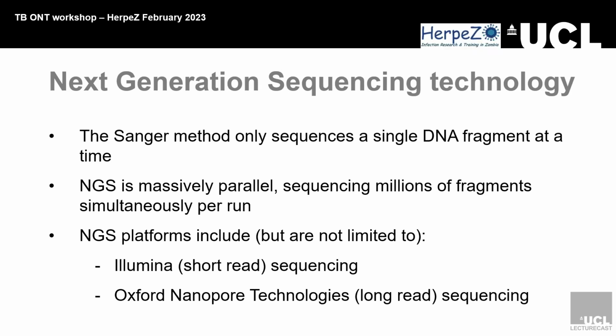So there are two main platforms that are used for NGS sequencing. Illumina, which uses shorter reads, like you were saying, from 35 to 600 base pairs, Keith? 300 on each side, right? Yeah. So you're not reading the full, you're reading the two halves. And Oxford Nanopore, which is the longer read sequences.